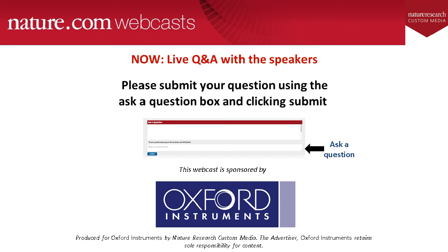So our next question asks, why is the element hydrogen not detected through EDS? Louise, is that something you can help answer? Yes, I can answer that question. So hydrogen doesn't produce a lot of X-rays. It's quite a rare occurrence. And the X-rays that are produced by hydrogen are such low energy that it is very, very difficult to actually detect them. They'll most likely be absorbed by the materials made to construct the detector. So for that reason, hydrogen can't be detected with current technology.